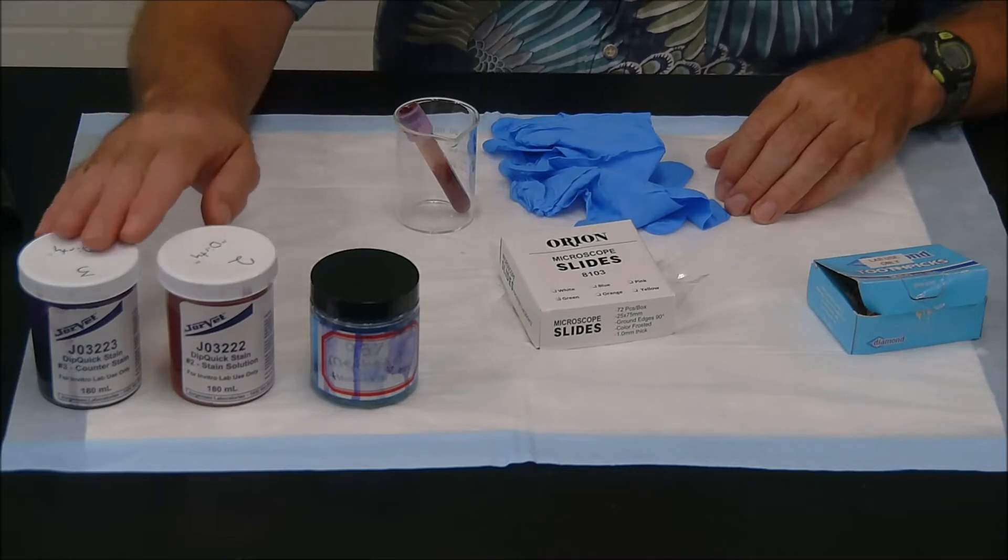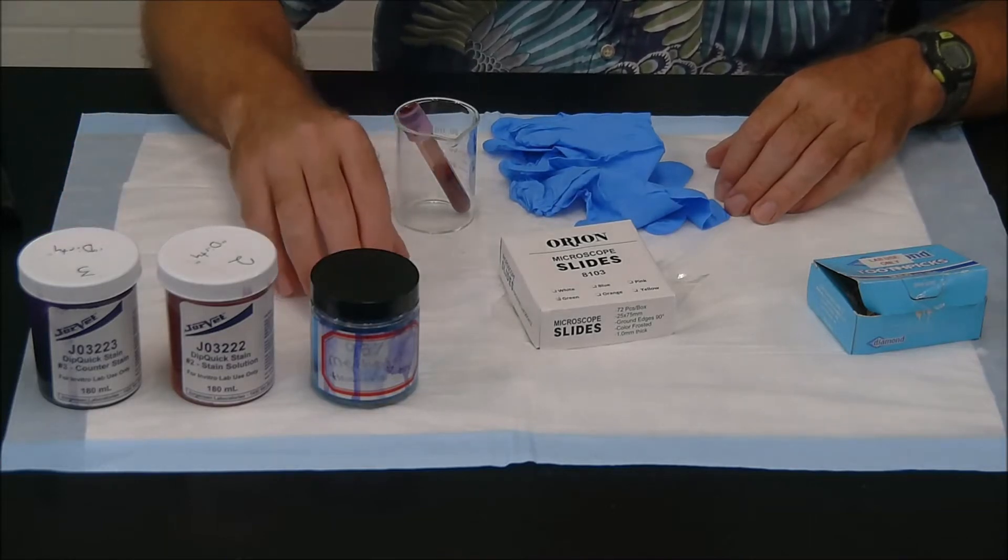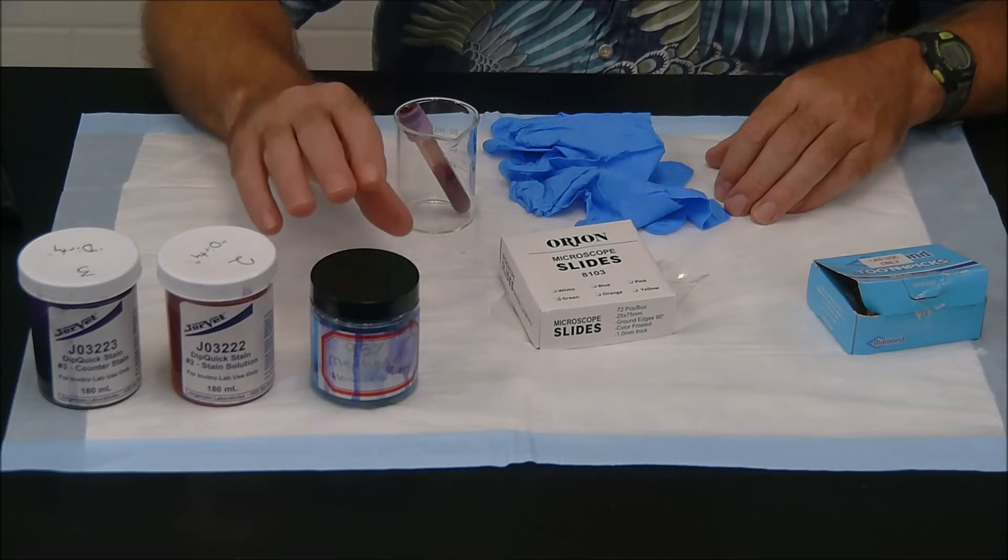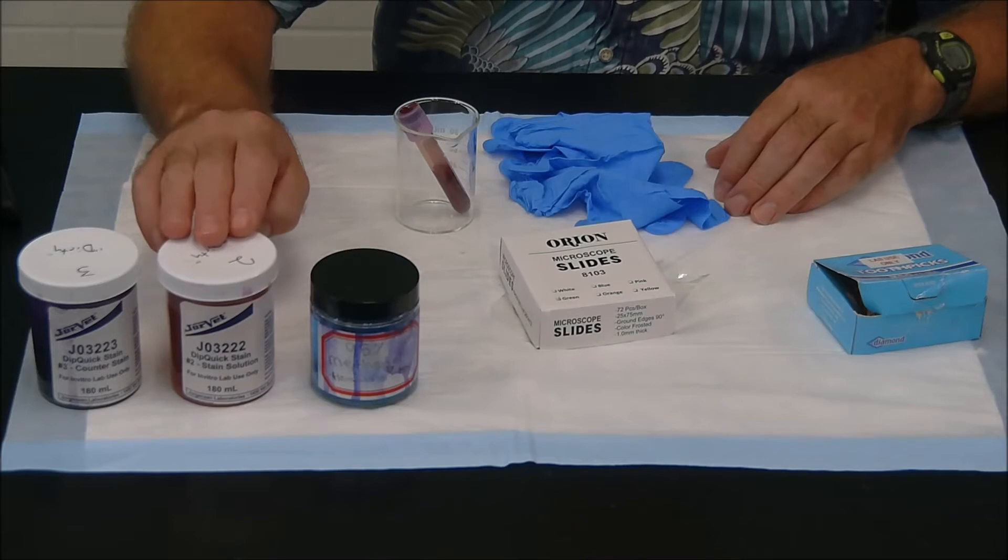And then we have three different stains here. First of all, what we have here is methanol. And methanol is going to act as our fixative. And this is the primary reason we're wearing gloves because methanol is very, very toxic. After that, we're going to immerse our blood smear in the second stain here, which is eosin. And eosin is going to stain most of the cytoplasm.